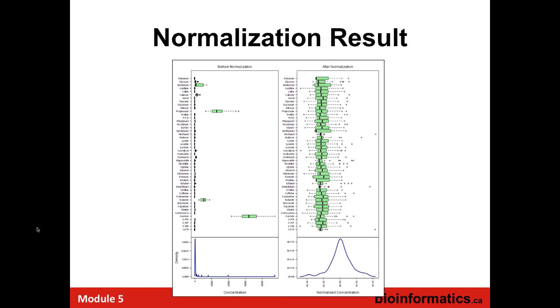Then when you're dealing with concentrations, log scaling works really well most of the time. Auto scaling works really well most of the time. What Jeff has done recently is he's made this interactive. So in the old days, it was kind of tedious, and if you guessed wrong, then you'd spend hours going backwards. But this one, you can do in 30 seconds. You can see whether your first guesses worked or not.